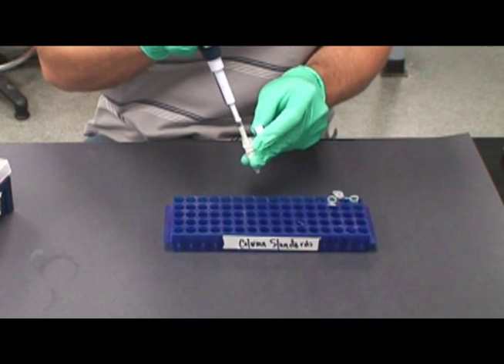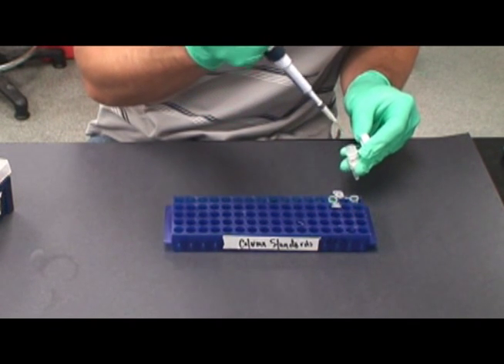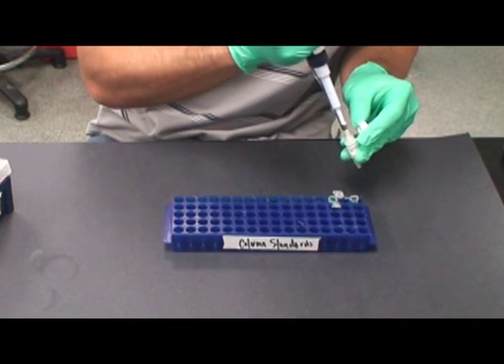First, add 4 microliters of Lambda DNA into both of the 0.5 milliliter microfuge tubes using a sterile micropipette tip.